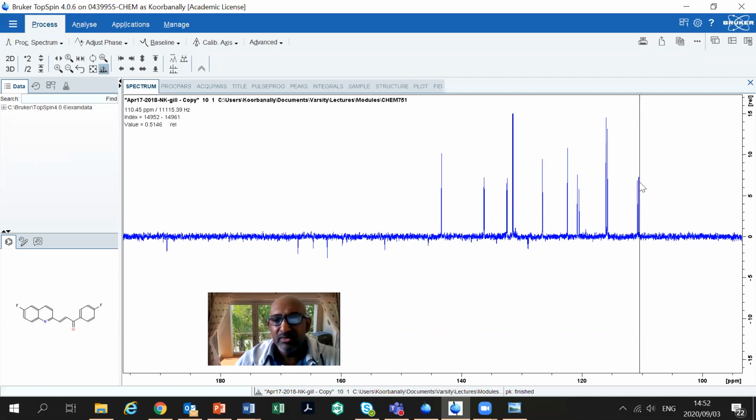The next part of the session is going to be looking at this carbon-13 NMR spectrum in correlation with the structure, and we'll see that everything is not as nice as it seems because I have a fluorine in here, and this fluorine will couple the carbon, just like I said with the chloroform peaks that you saw, which had coupling in them. This fluorine will couple the carbon into doublets that you'll probably see in the spectrum as well.